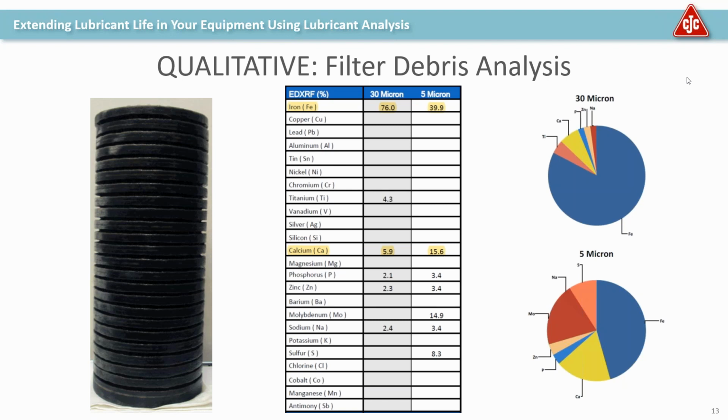Most of the time we will see this in phosphate ester fluids and a couple of other systems, and really you're just looking to make sure that that lubricant does not conduct electricity. Insulating oils are a big one where you would have resistivity results, and in EHC systems, most use a phosphate ester because it is a fire resistant fluid. So one of the properties you want to look at is its resistance to conducting electricity so that it does not create a spark.